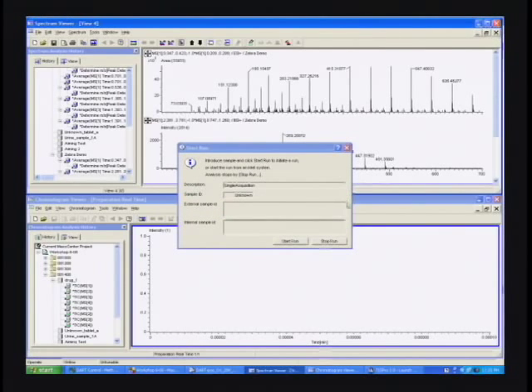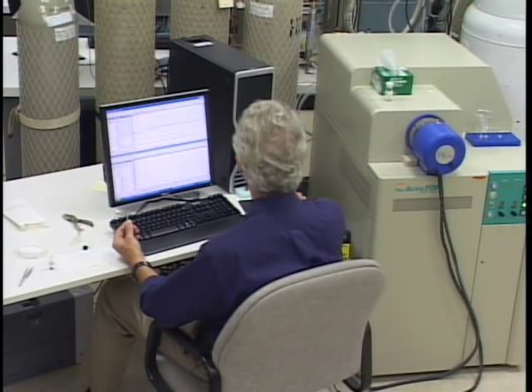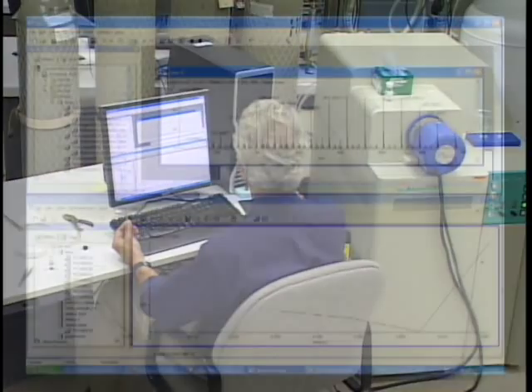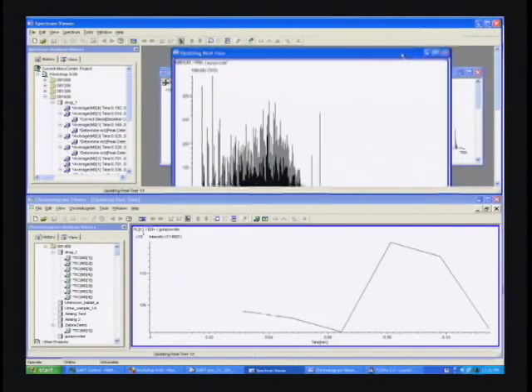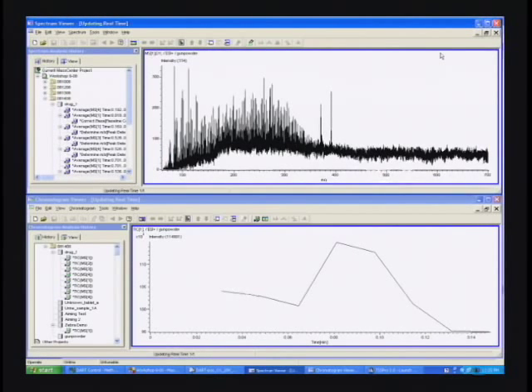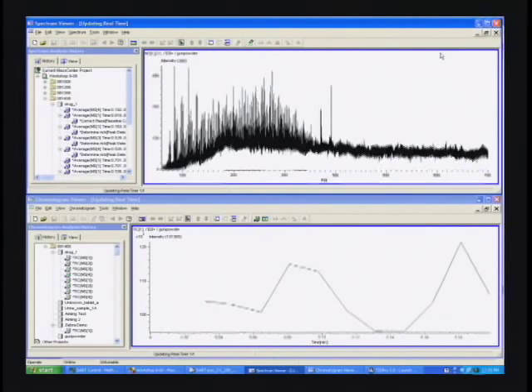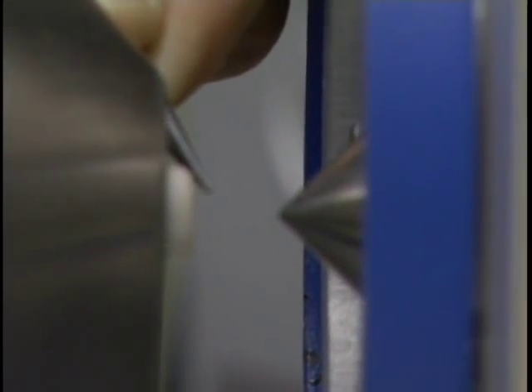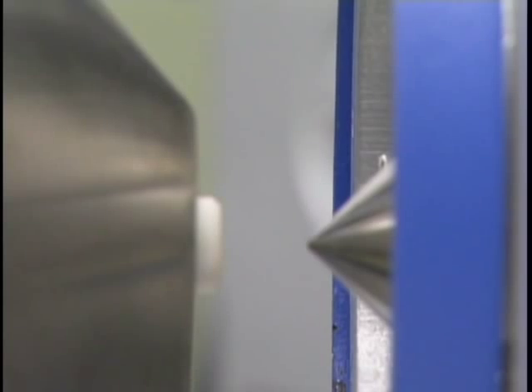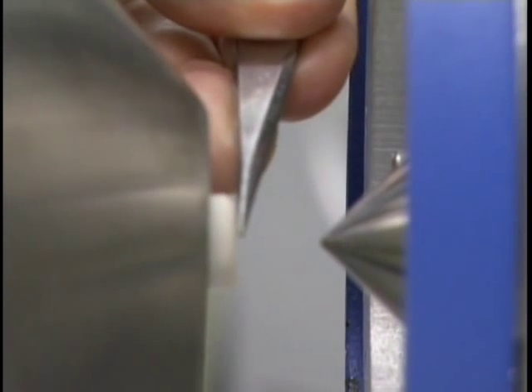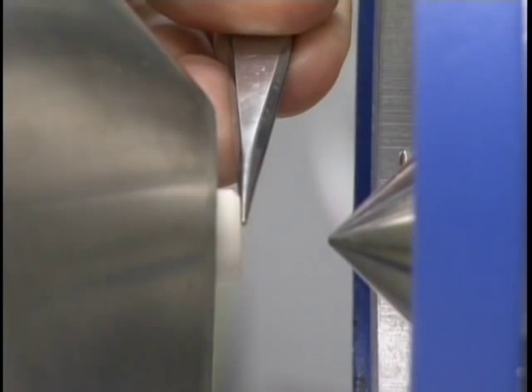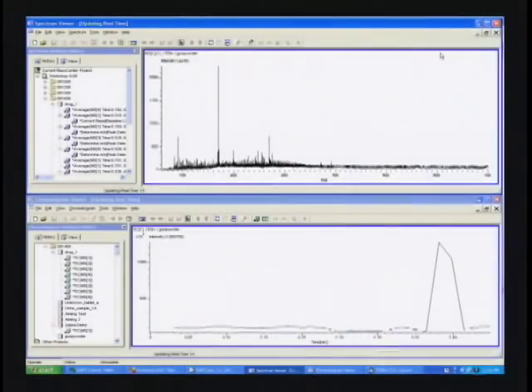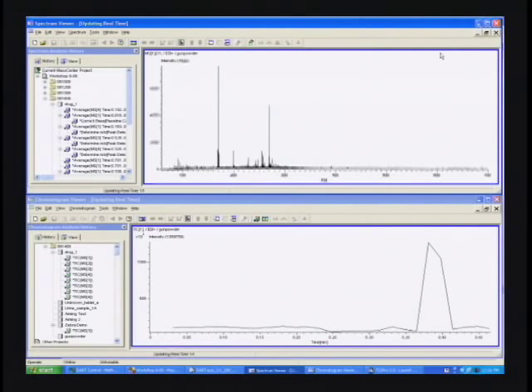I'm trying to get a window here so I can see what's going on. Here's the spectrum. Let's see if we can get this in front of the dart without dropping it. Get a better grip on it. There we go. We've got some peaks from it. We'll go ahead and set that back down.